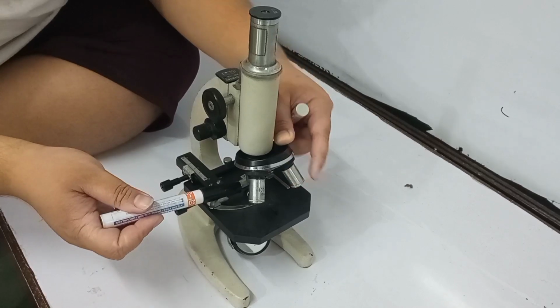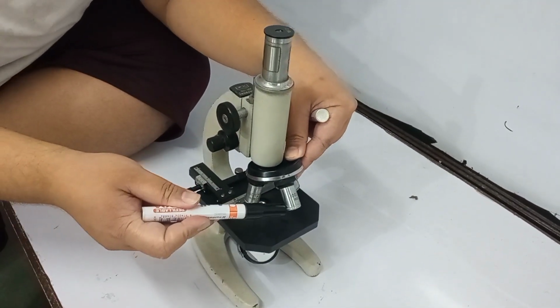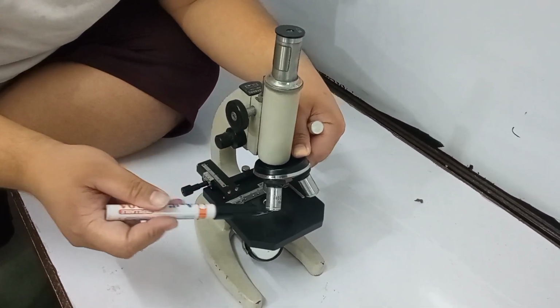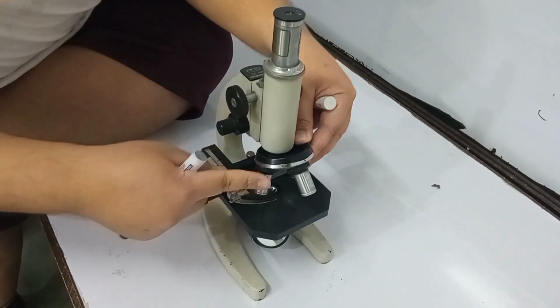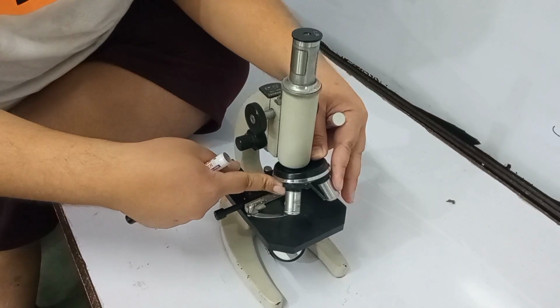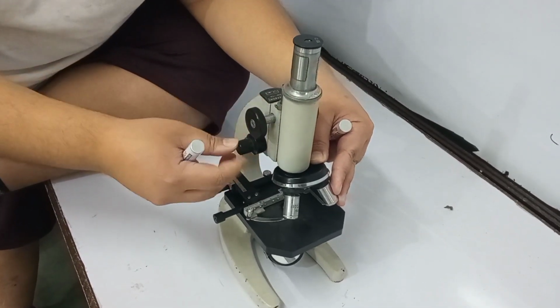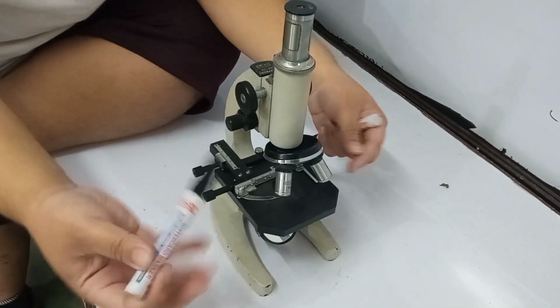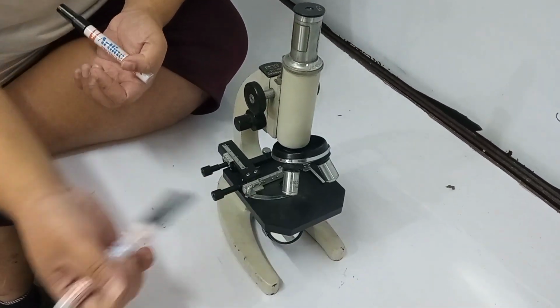This one is the medium power, and then you have there the high power. Kapag okay na siya, maki-click siya, and then you move the objectives to observe the specimen.